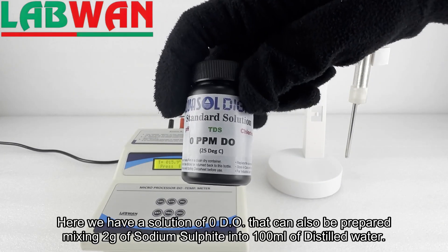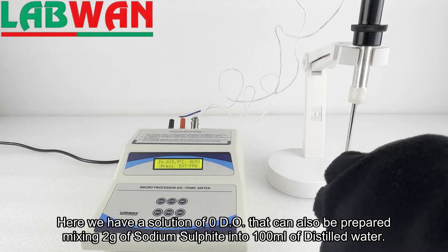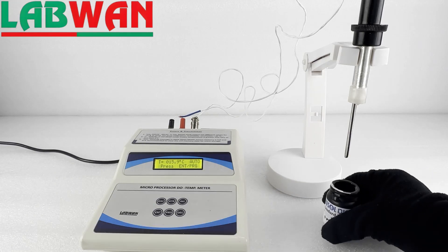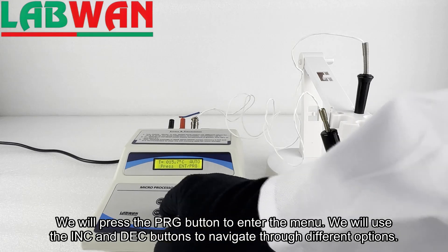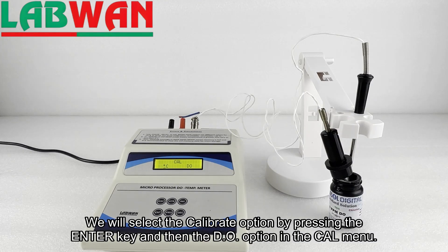Here we have a solution of zero DO, which can also be prepared by mixing 2 grams of sodium sulfite into 100 milliliters of distilled water. We will press the PRG button to enter the menu, then use the INC and DEC buttons to navigate through different options. We will select the calibrate option by pressing the enter key and then the DO option in the CAL menu.